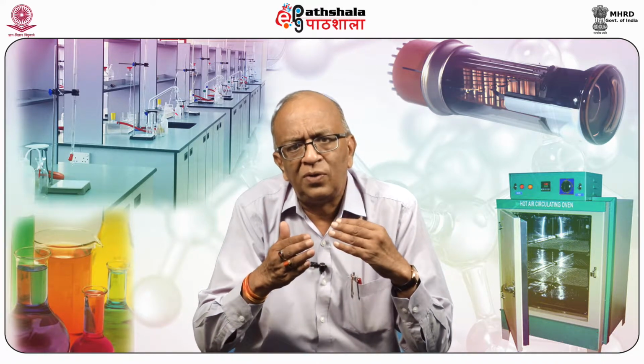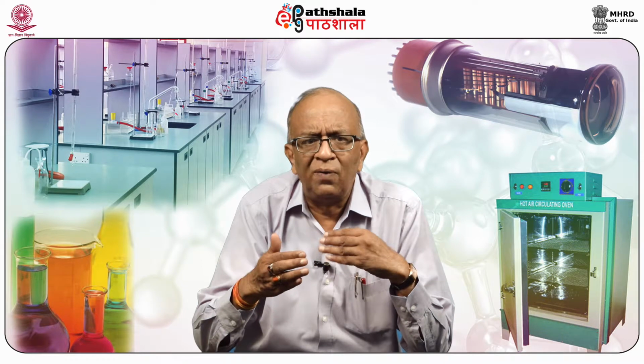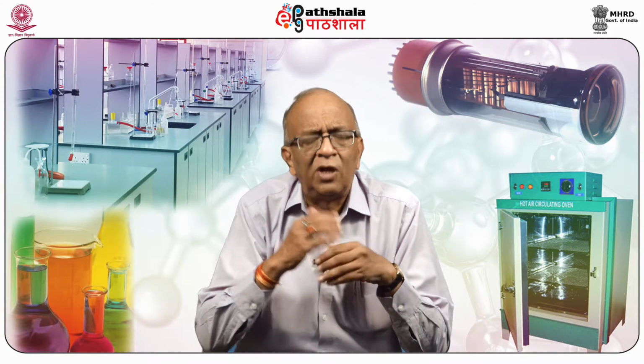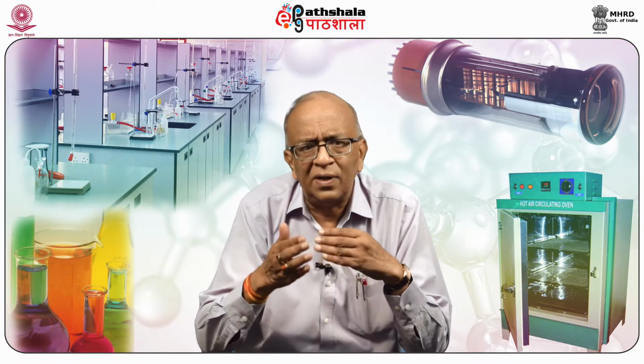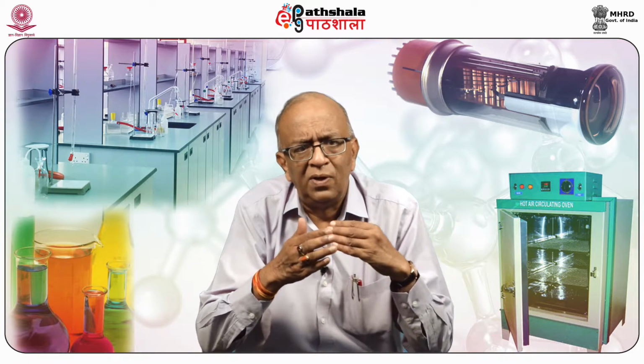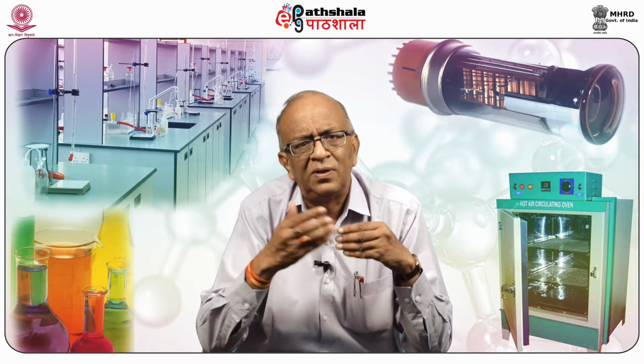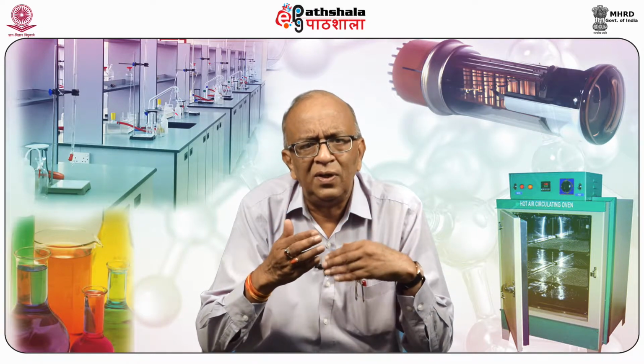Mass versus temperature, a plot will be drawn between mass and temperature. Another type of thermoanalytical technique is derivative thermogravimetry, which is also called DTG in short.